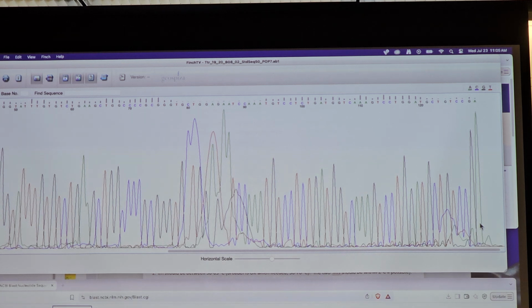I've asked people at Applied Biosystems, and I get some sort of weird hand wavy answer. But the answer is that's where they come out, and it's always in the same place, and it causes the same problem. If you take your sequencing reaction and put it through a Zymo column a second time, a new column, so do a double purification, you can actually knock that down.